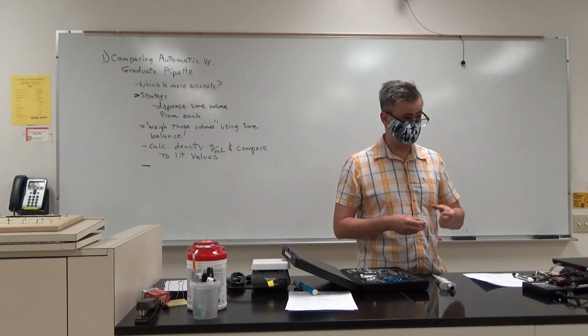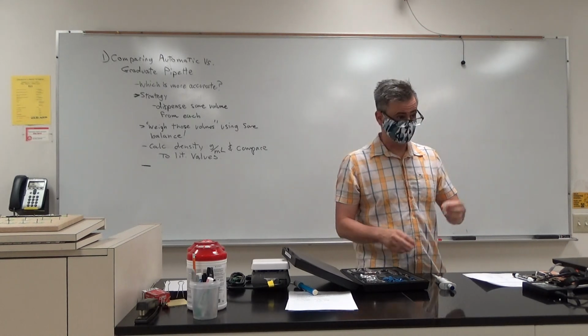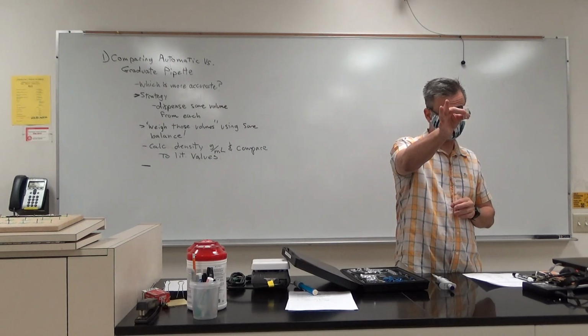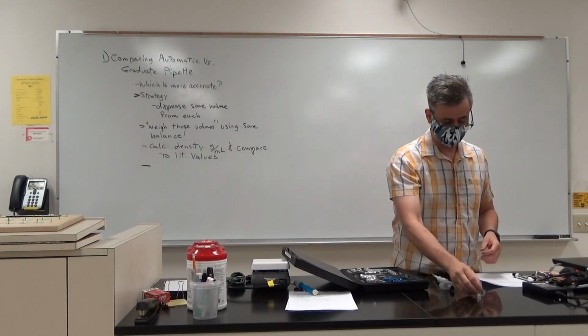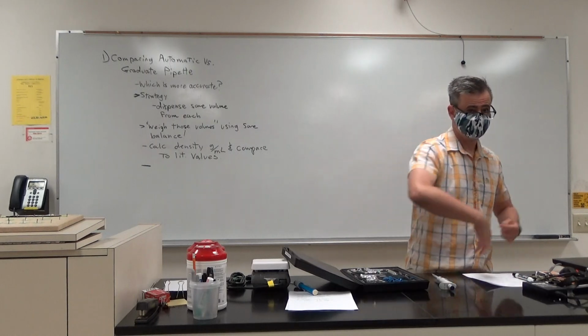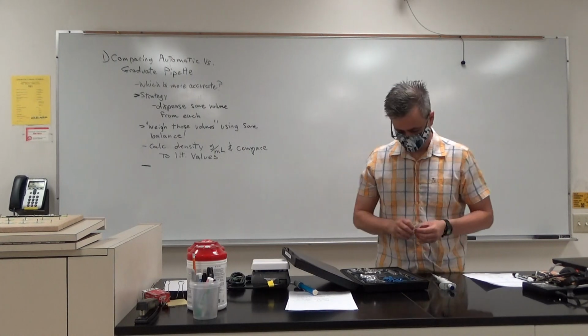Basically, it's just a regular beaker, not an Erlenmeyer beaker, but a regular beaker, where this sits in it. And pick one that's appropriately sized. So for a small guy like this, you might pick a 50 ml beaker. That way it can't tip over. It's super easy to accidentally knock it over, and chemical spills all over the place. So always have a secondary container.